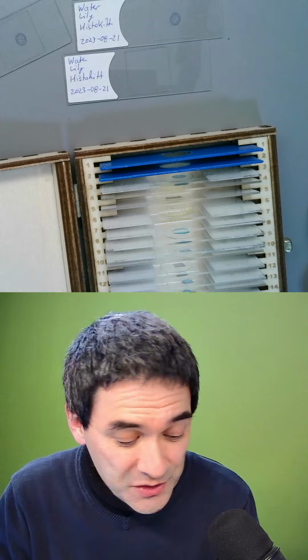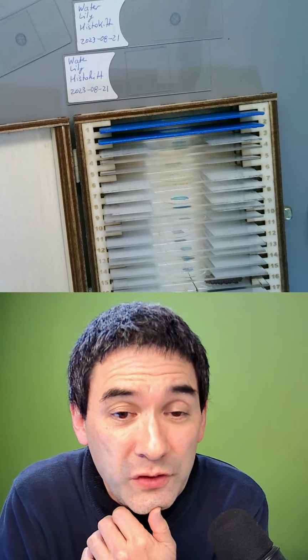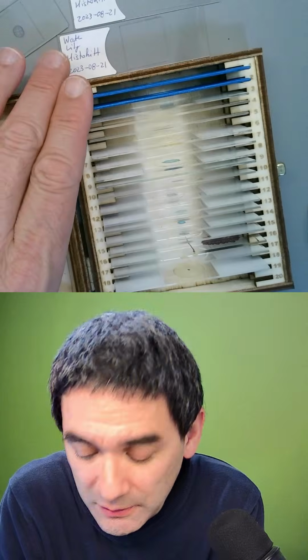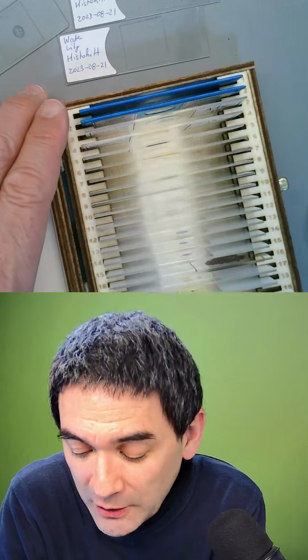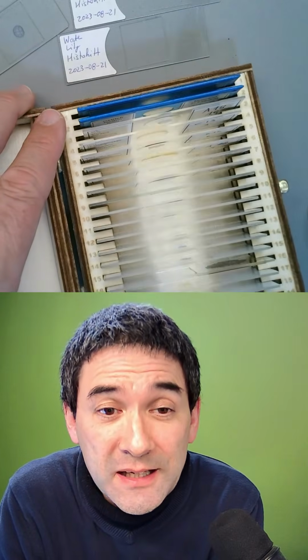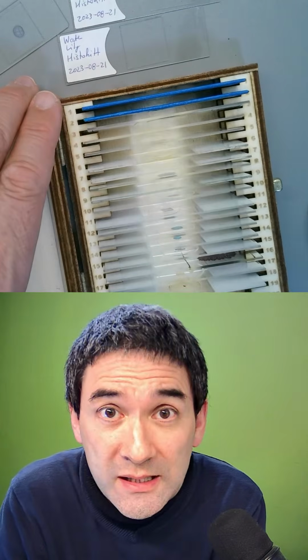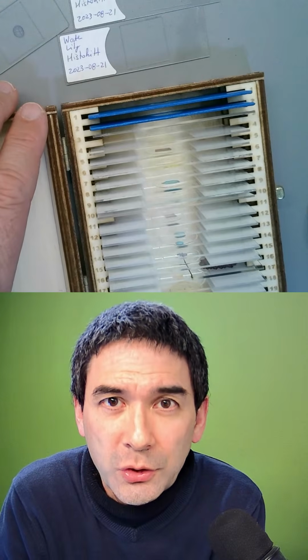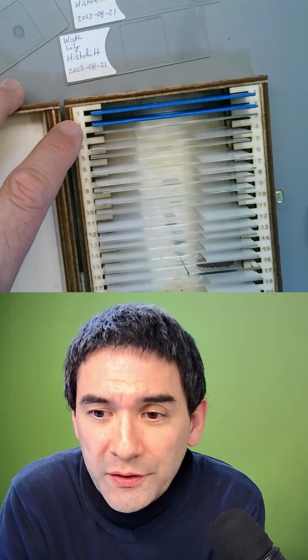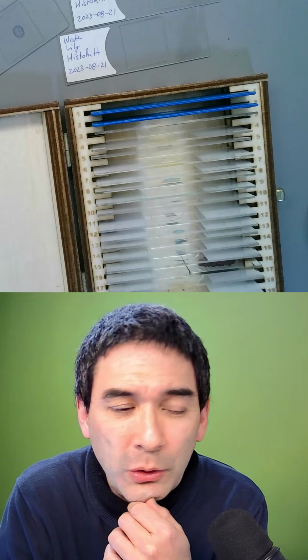We're going to see how this actually works out this time. Because it's a little bit experimental, I decided to do something a little bit traditional again, because maybe there are going to be a few new viewers. I've put out a whole bunch of microscope slides, which I consider to be some of my favorite ones. Not all of them are made by myself; some of them are commercial slides, but they look kind of nice. Every now and then I return to those, and I would like to share them with you. Of course, this also gives us an opportunity to chat about other things that you might want to talk about.